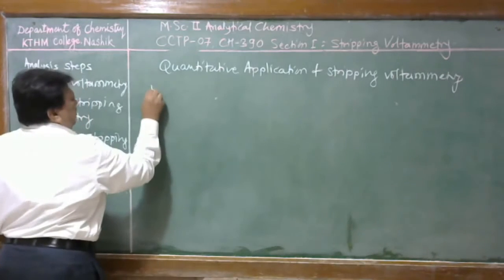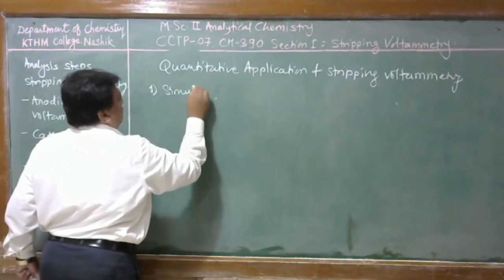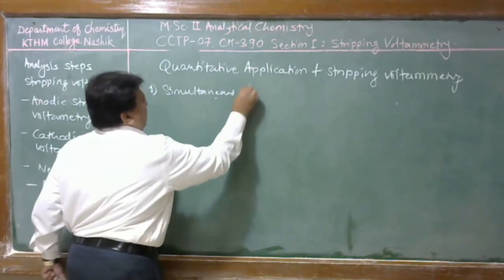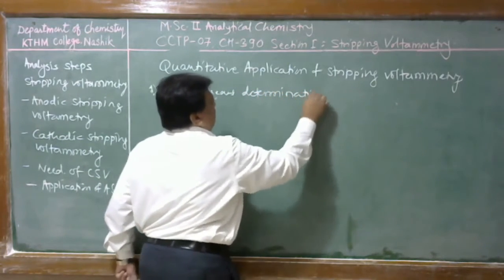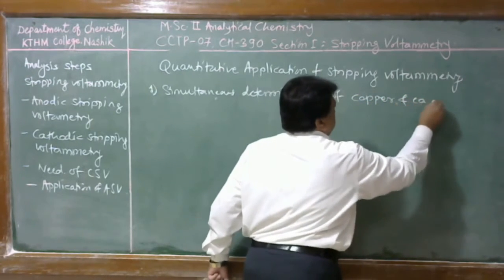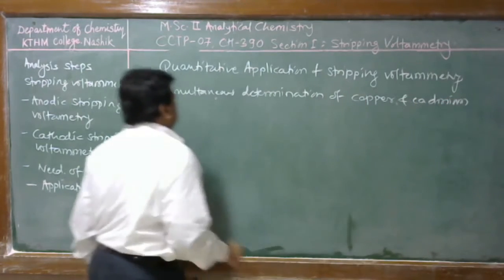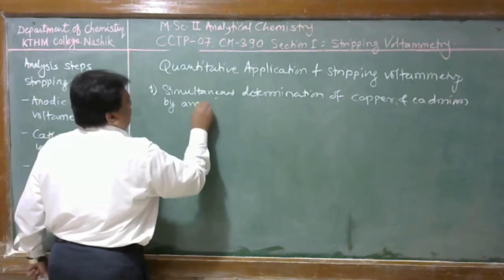First application: simultaneous determination of copper and cadmium by anodic stripping voltammetry.